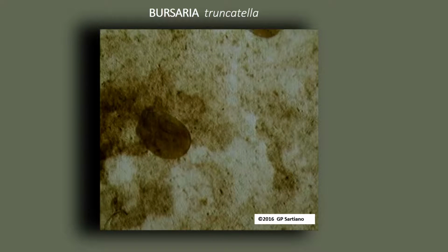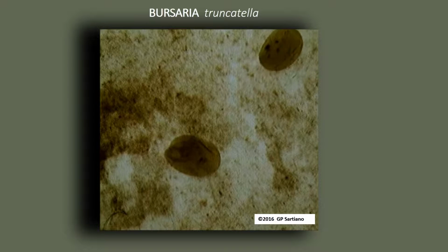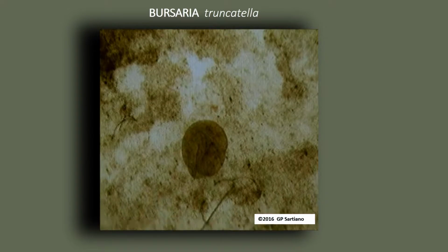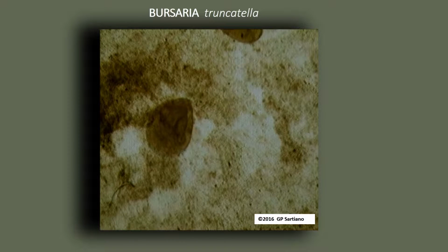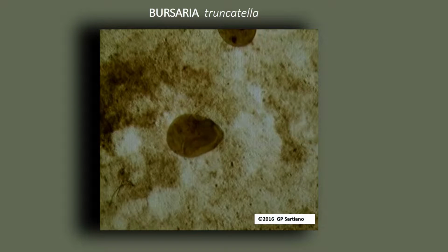When slowed down by cover slip pressure, Bursaria moves forward more slowly, mouth open, and shows a remarkable degree of pellicular softness and flexibility, and a tendency to rounding up into a more compact shape.